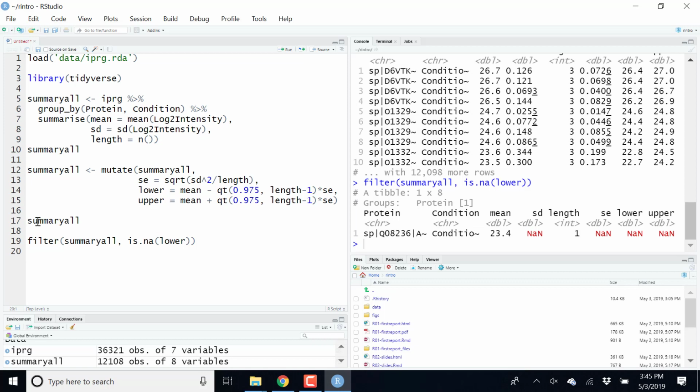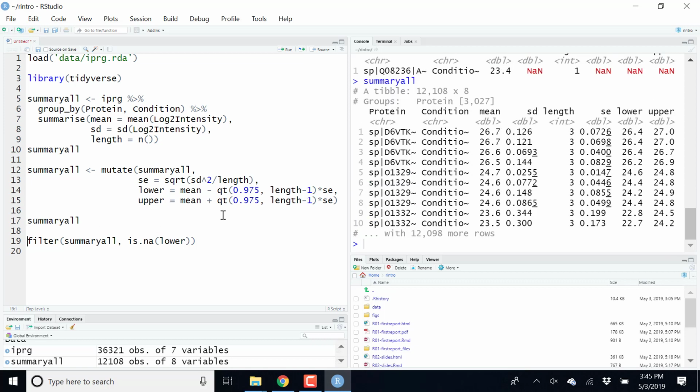So this new summary table has all the summary values for all proteins for all conditions. Now we are going to use this new data and plot the same plot for each protein. There are some ways we can calculate and draw it, but I will try two methods.